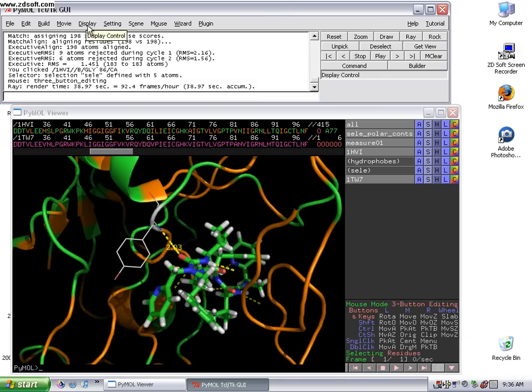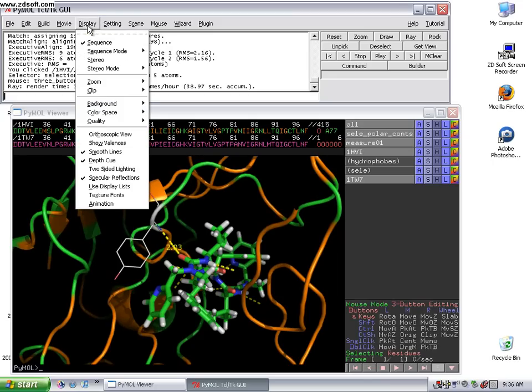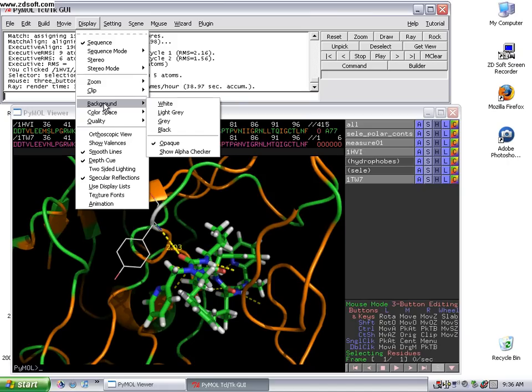That's pretty much it. Finally, one last thing. After you're ready to print out your image or show it on a PowerPoint, often times you want to show it against a white background. So if you go to display and then background white.